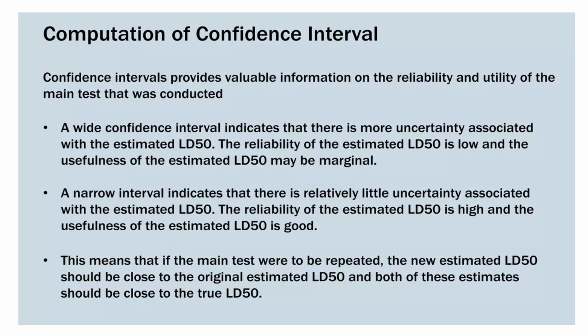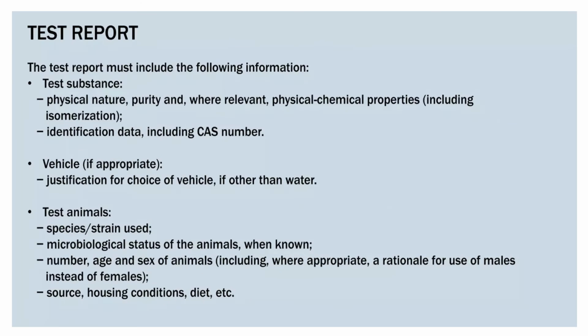Okay, what that means is, if the main test were to be repeated, the new estimated LD50 should be close to the original LD50, and both these estimates should be close to the true LD50.